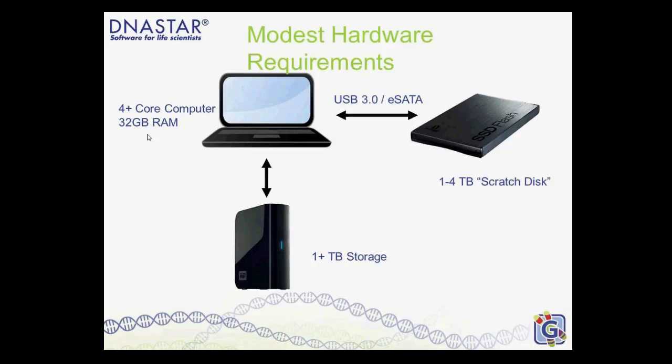You can also use laptops for some of the smaller projects. So if you don't have a big, powerful desktop, you can get by with a laptop, provided you have another disk that can process data. We call this a scratch disk, and this is key for the performance of our software. The scratch disk can be plugged in externally through USB 3 or eSATA, or it can be another internal drive in a laptop. Sometimes you can swap out a DVD-ROM drive for another hard drive. It's really the performance of this drive and the speed of your processor that impacts performance more than anything else. So it's just something to keep in mind.